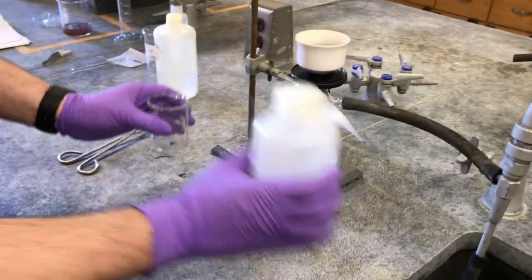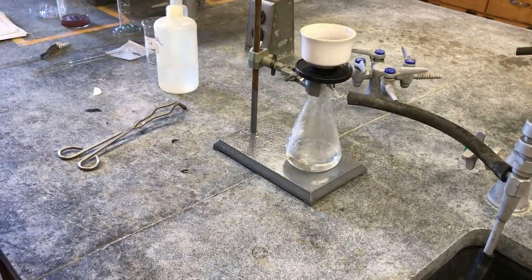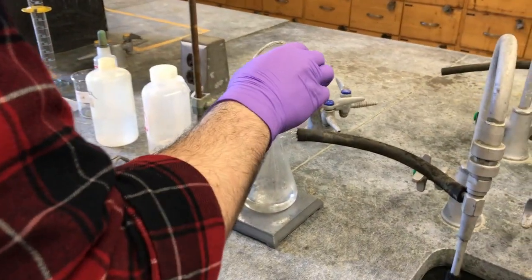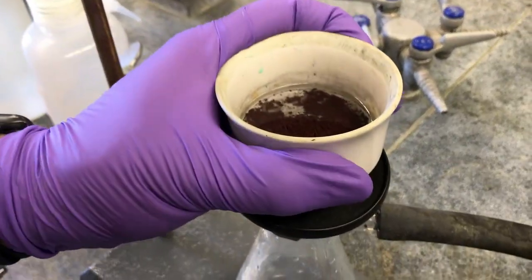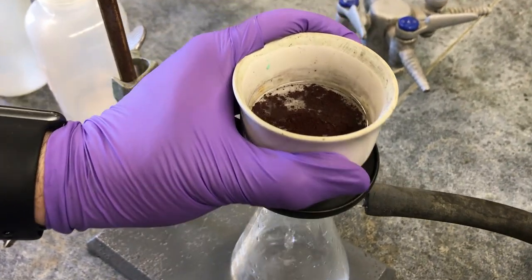And one more time. Notice how I'm doing it around the edges so that some of the copper doesn't go underneath the filter paper.